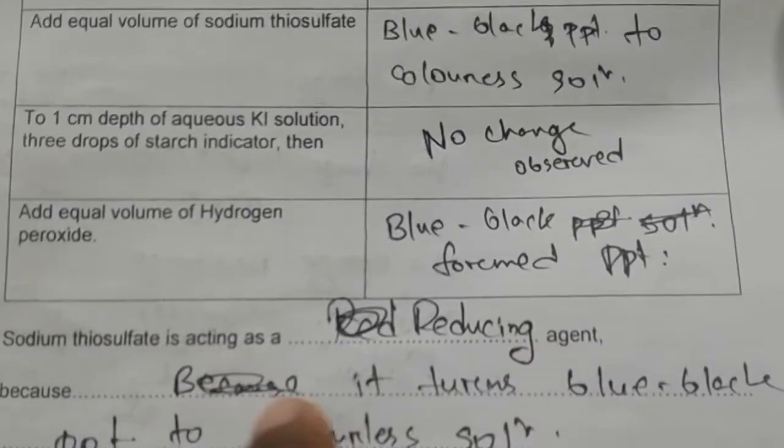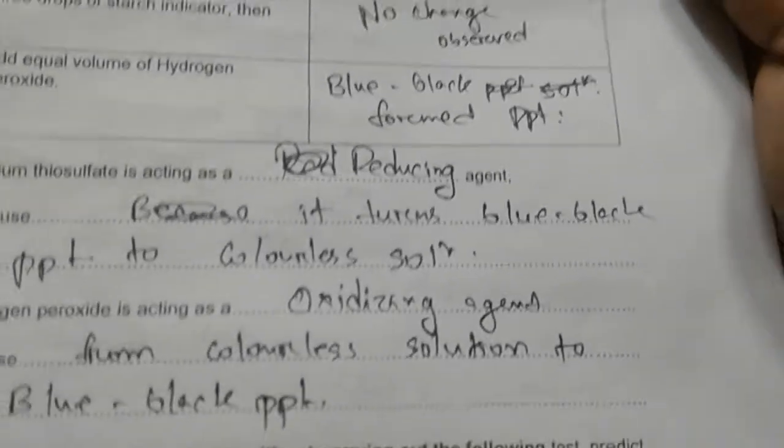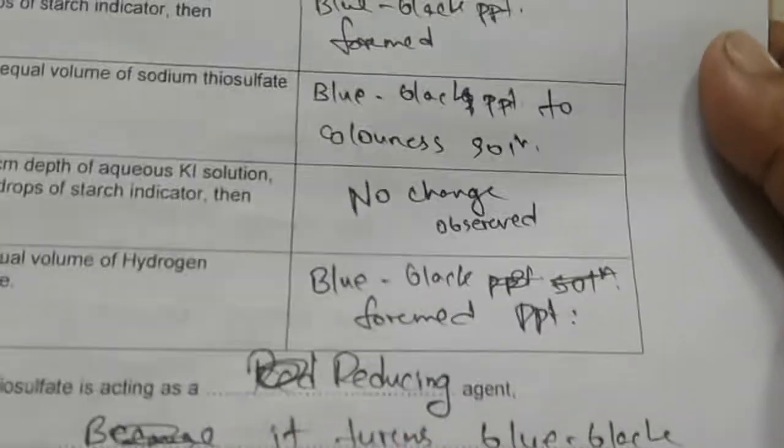Okay, because blue-black turns colorless, that's not a perfect answer. He must write that from iodine to iodide.